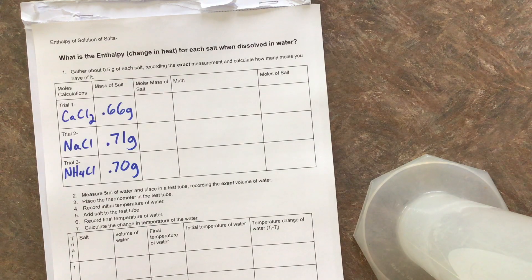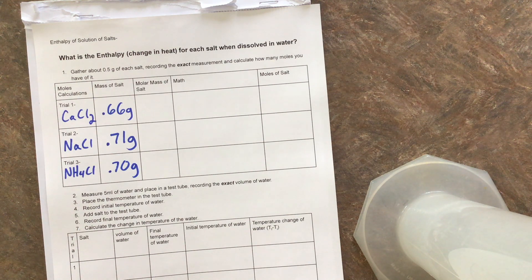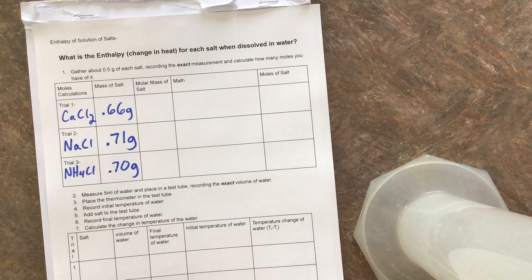You see it was supposed to be about 0.5, in all cases it was over. That's okay, we're keeping track of that mass. Next, let's go ahead and figure out the molar mass of the salt, and then use our math to figure out how many moles of salt we actually have.